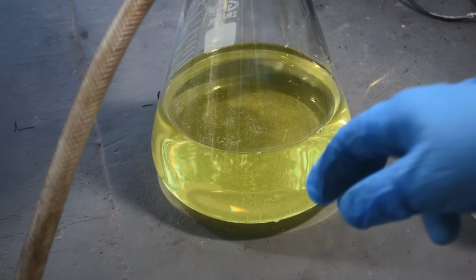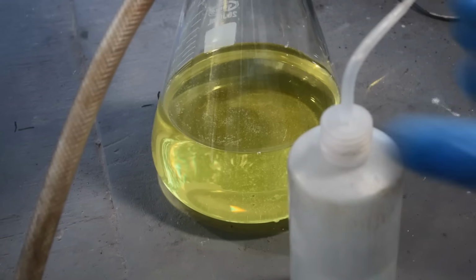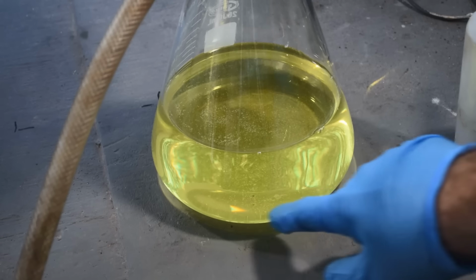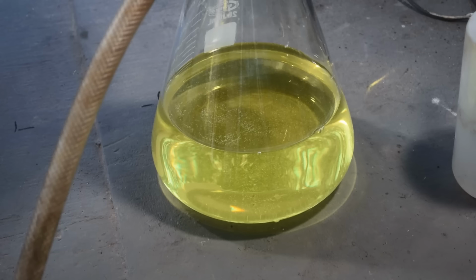As this stuff gets more and more dilute, because I've been using rinse water to rinse the pregnant solution out of the solids up in the filter, more crystals have come out of solution, and I see them laying on the bottom of the flask too. So I was just going to transfer this to a beaker and throw some SMB in it and drop the gold and leave it to sit and settle overnight since it's getting late in the day.